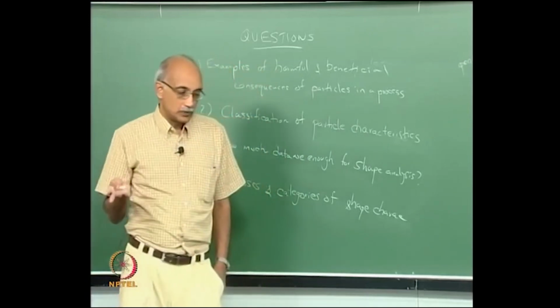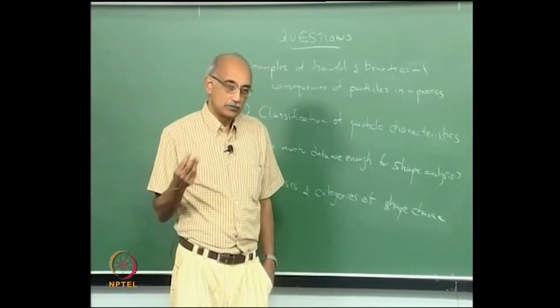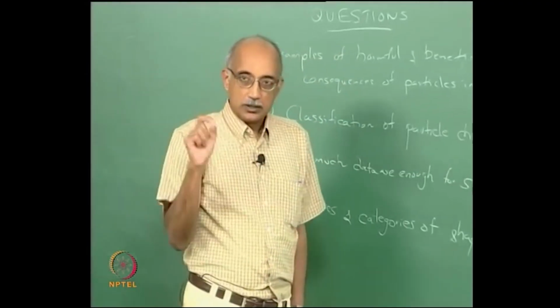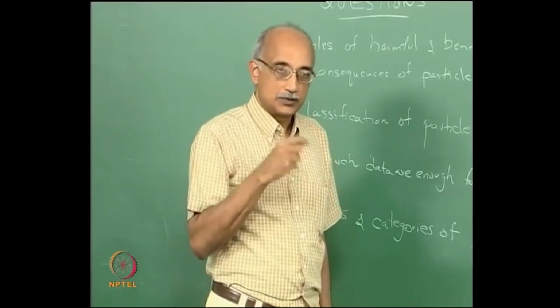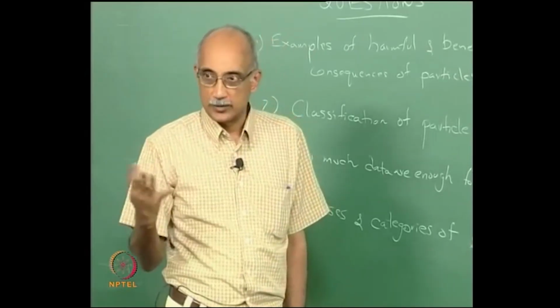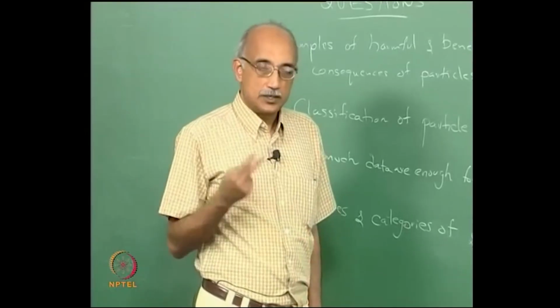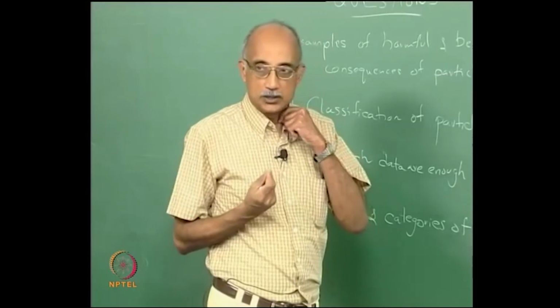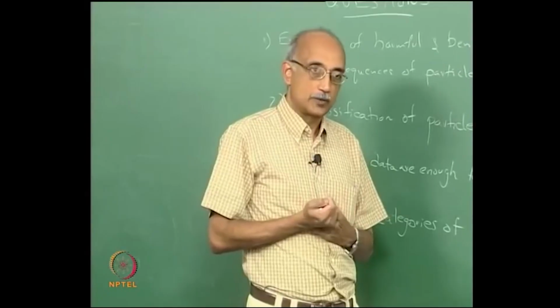And then the third class of methods, which is the mathematical methods, again has 3 major classifications. One is simply the digital characterization, representing the shape of the particle essentially as a 3-dimensional matrix map, which can be compared against other similar maps. The second is polynomial fits, taking the data and fitting a continuous function through the discrete data points in order to obtain a functional representation of the profile of the particle.